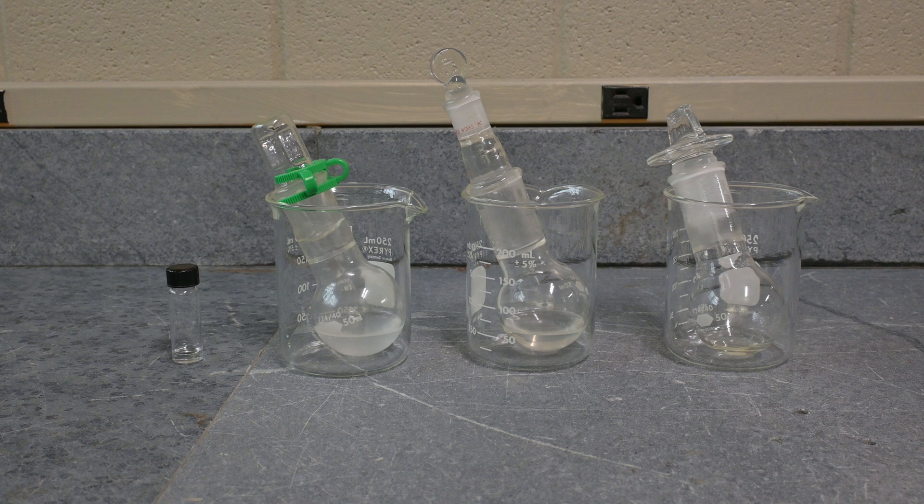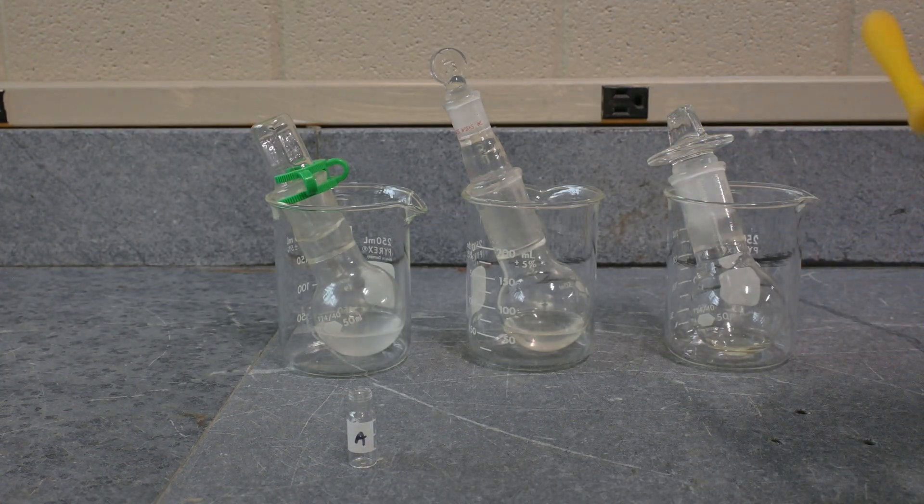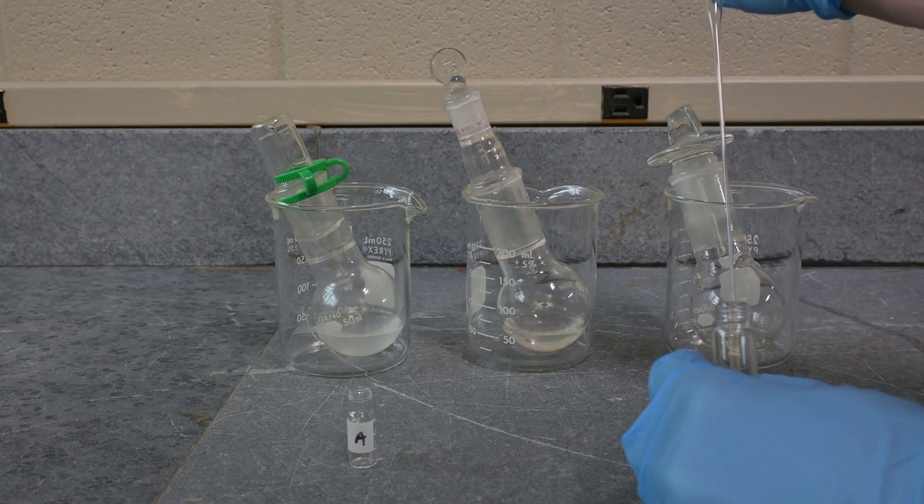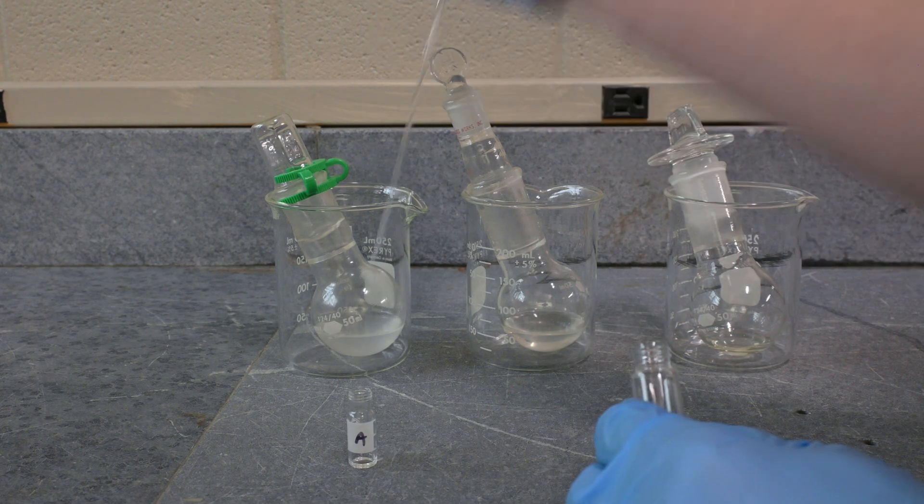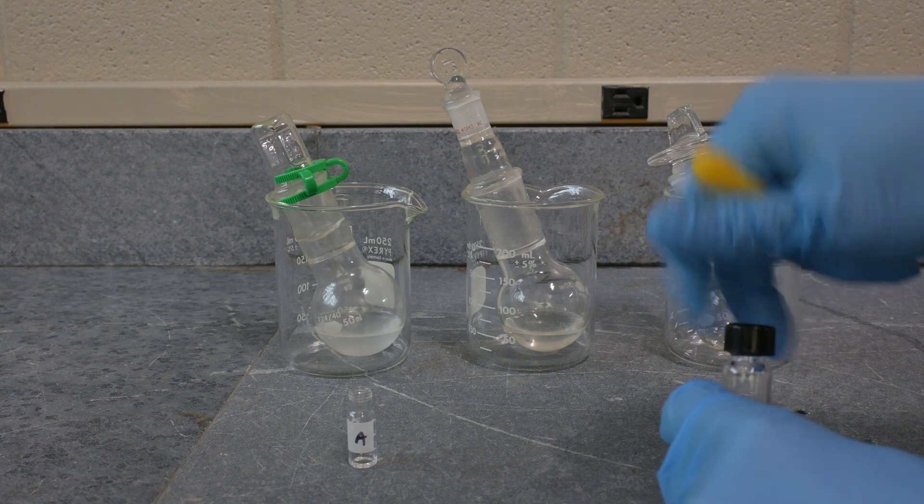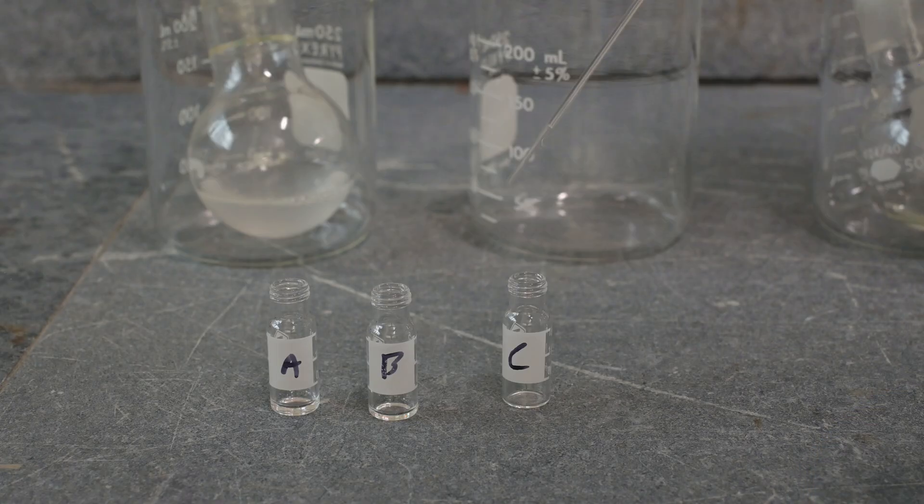I prepared four GC vials. Labeled them according to the order in which the distillates were collected. I took a small sample from each collection flask and placed it into the vial. It only takes a very small amount for a sample to be analyzed. If you can see the analyte, you have enough.